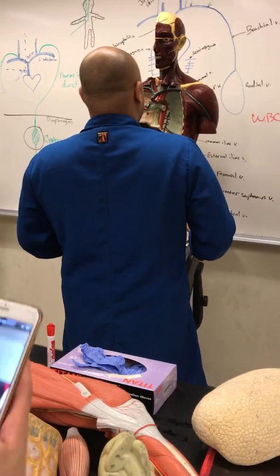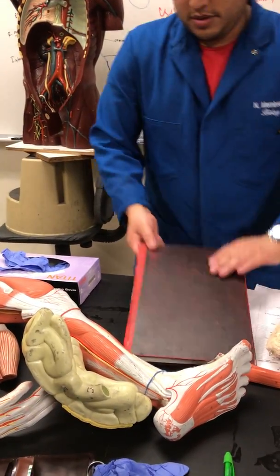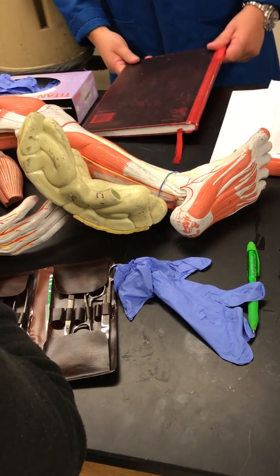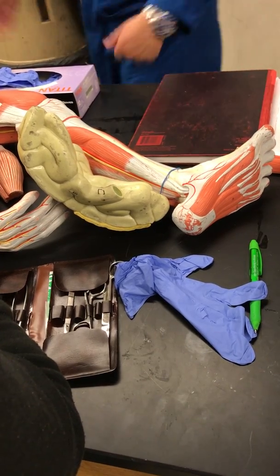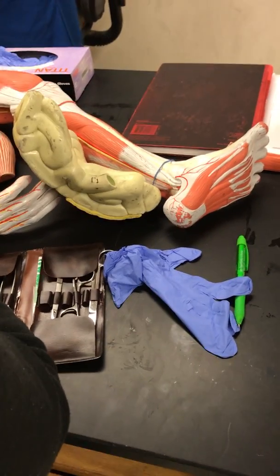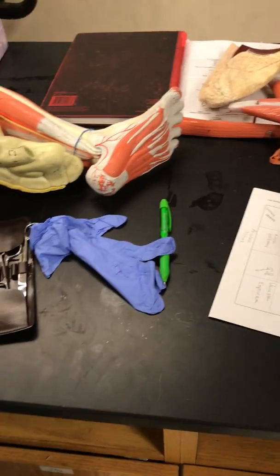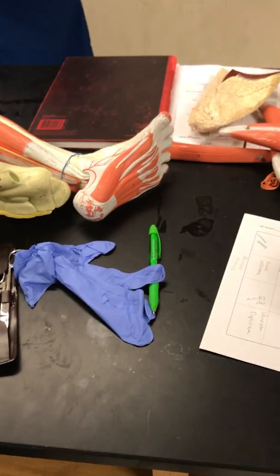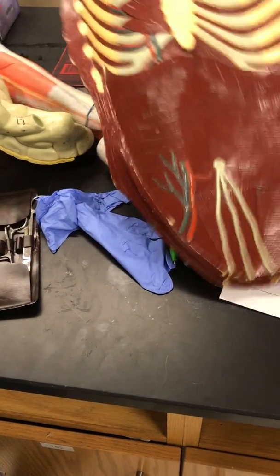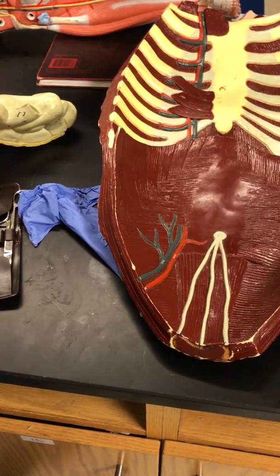Yeah, that's all I can think of at the moment for this guy. Last class I went all the way through. There's still 10 minutes. Oh, the heart. Yeah, we're the last lab. You guys got plenty of time to put away the cats. Let me go over the heart. Okay, hang on. Yeah, let's go over the heart. So I'll do the heart and then, oh, that's right, this one. This heart.